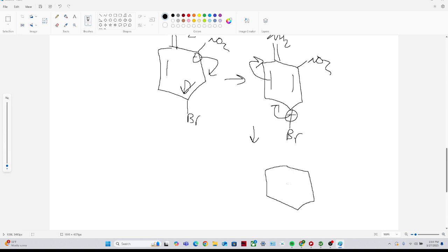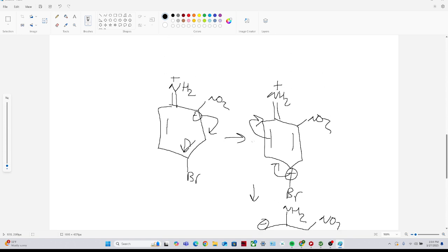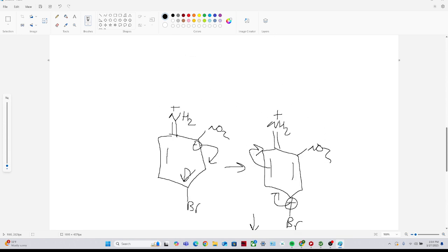And this is actually the key to this experiment, to figure out one of the proton positions or chemical shifts: this guy right here. Okay? And so all I've done is essentially delocalize the electrons, and I just drew the resonance contributors. But what's important to note is that this carbon, which also has this hydrogen right here, is going to have greater electron density. And if you recall, greater electron density means you're going to be more upfield because you're opposing the magnetic field that the NMR machine is applying.